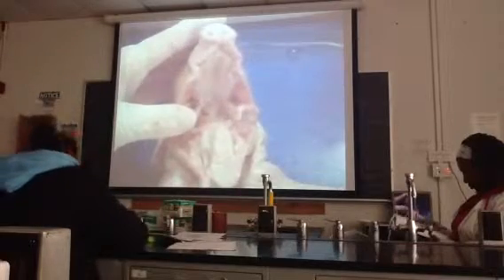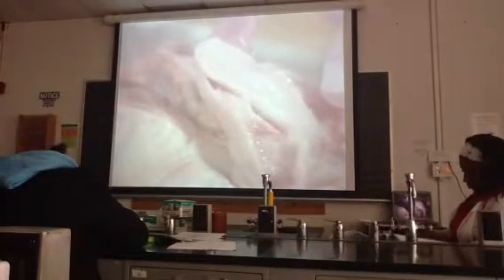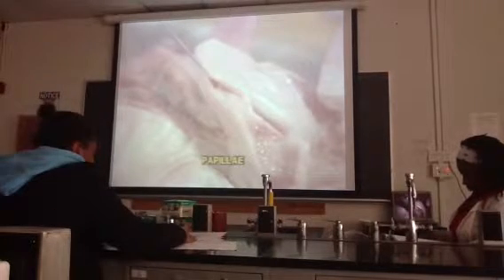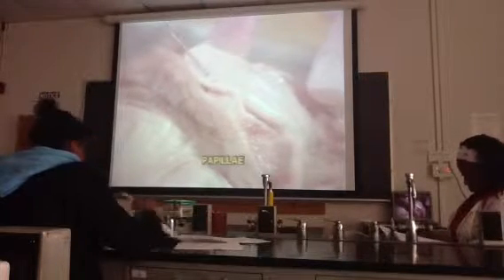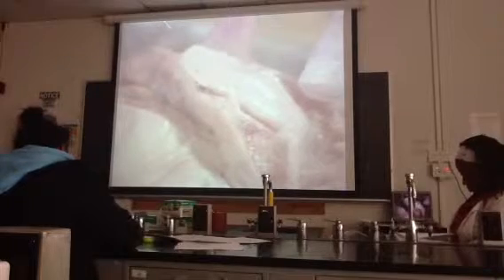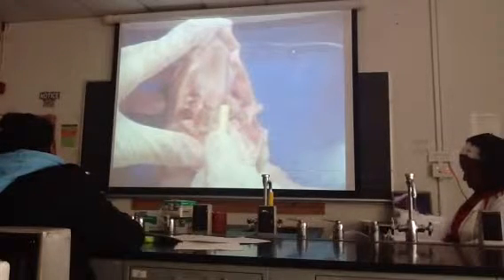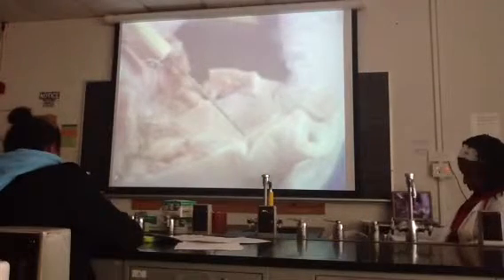Observe the tongue, which has numerous little bumps called papillae. These papillae contain the taste buds, which function in taste. On the roof of the mouth, observe the teeth that have already formed. These will help in physical digestion.